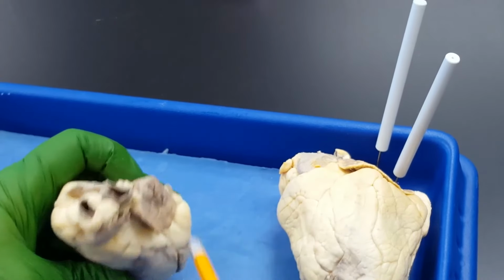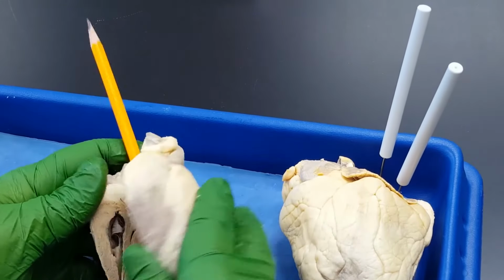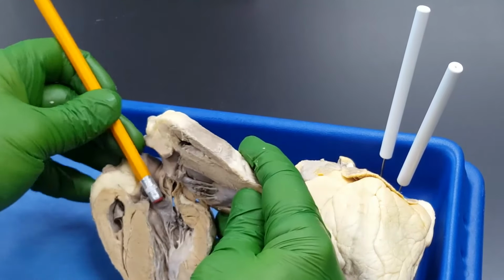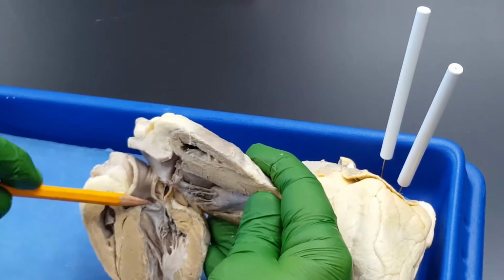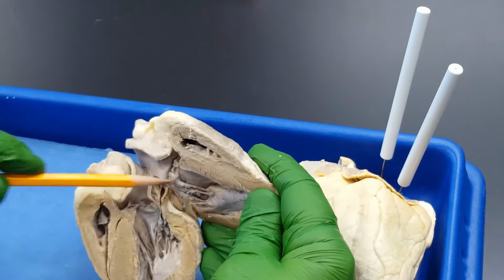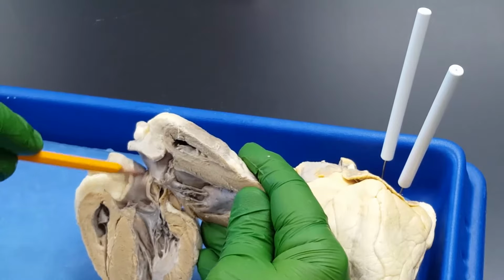Everybody watch. If I go back through the aorta, which forces me left again, right here, see the tip of my pencil? Right here, this is the aortic semilunar valve. Right there's another flap for it. Notice, no cords on this little flap. This big thing right here is the aorta.